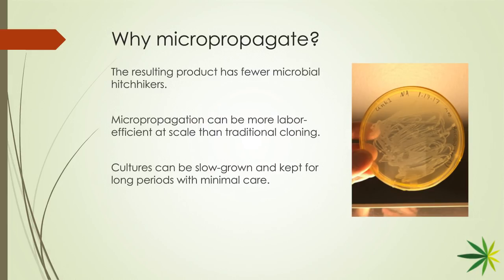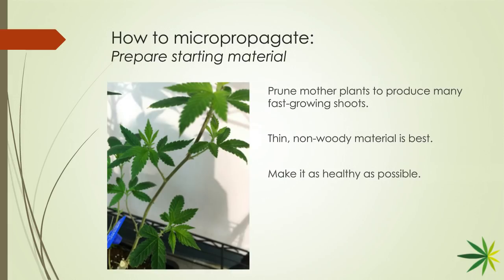Well, this is the meat of our conversation today, and I think people are going to be excited to really understand this particular part of our talk: how do we micropropagate? Where does this process start? Where and how does it end, and what are the steps in between? Once I understood it, I realized I had been told many different urban myths about tissue culture, and what I was told and what I learned were two different things. So I think this is going to be exciting for our audience to dive into. Let's go through these slides and break down how you do this.